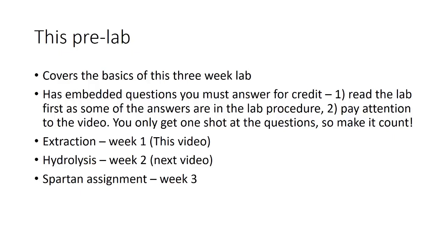First of all, this lab is going to be using materials from the introductory organic lab, 2251. Any of these procedures that you don't remember, it is very important that you go back and review those methods, as those methods will be required for you to understand what you're doing in this lab.